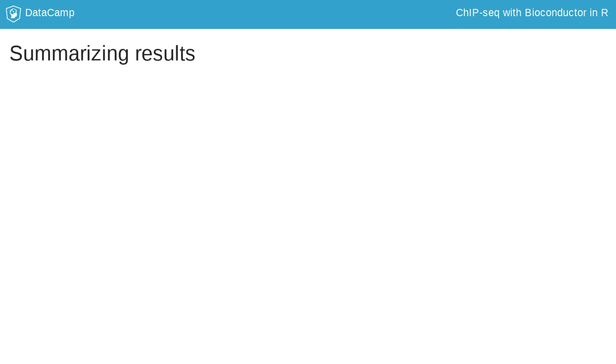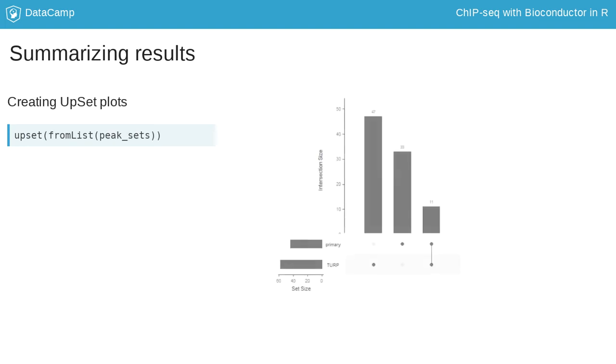Another helpful way to compare samples is to consider the number of peaks shared between samples as well as those unique to a given sample. The UPSETR package provides useful plots for this purpose. This makes it easy to quickly assess the degree of similarity between different sample sets.